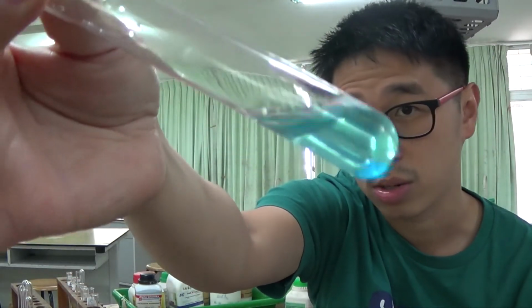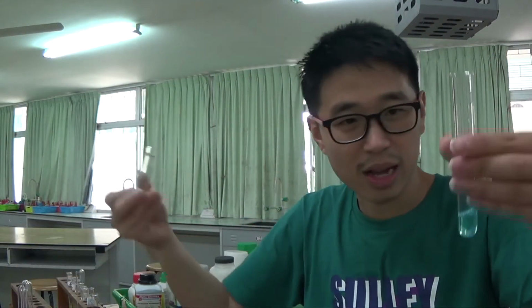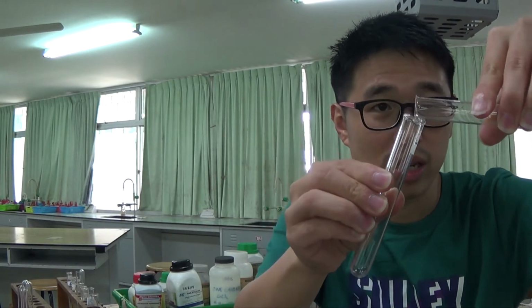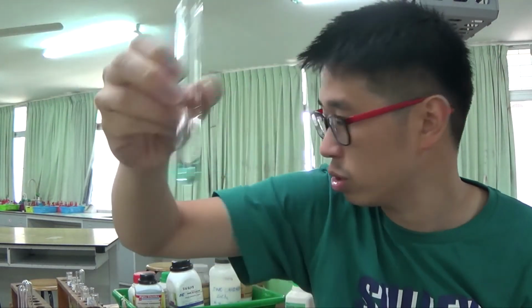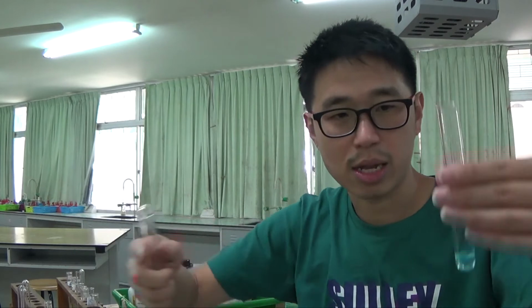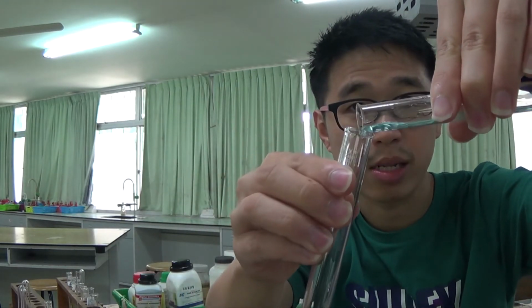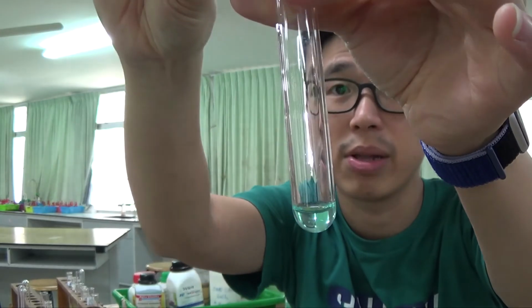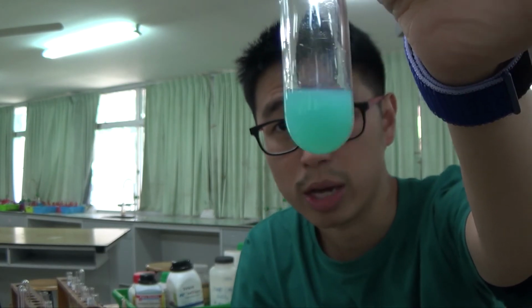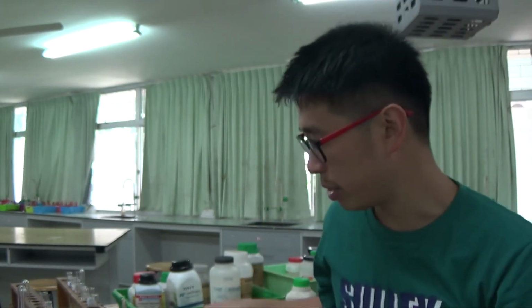My solution has already started to go a bit blue. I don't want the solid actually. So what I do is I just get the solution like this, pale blue solution. So it started with copper 2+. Copper 2+ is a pale blue solution like this. What I'll do is I'll add some ammonia to it first. Okay, this is ammonia. Alright, so add a little bit of ammonia and you get a precipitate, no longer solution. You get a pale blue precipitate in a little bit of ammonia.